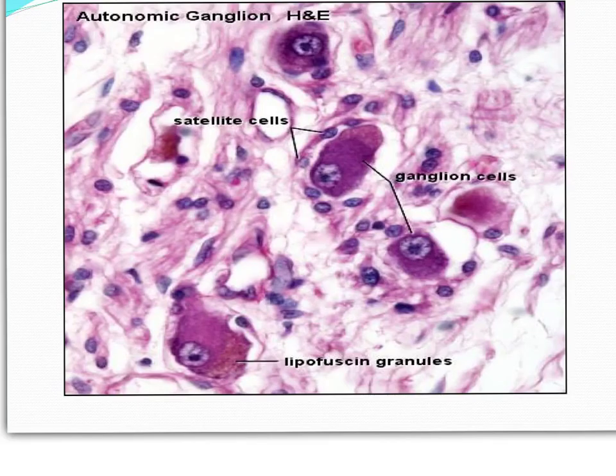In this picture you can see that we have many blood vessels. Here this is one blood capillary with blood, and this is another one. Also the cells appear to be scattered in the section. The cells are not so rounded, they are angular. So most probably it is a sympathetic ganglion.